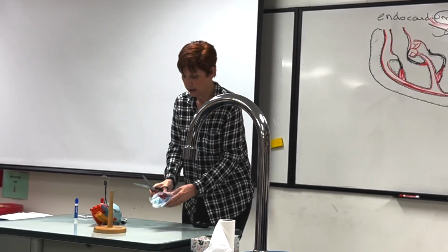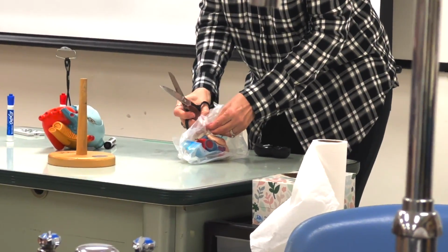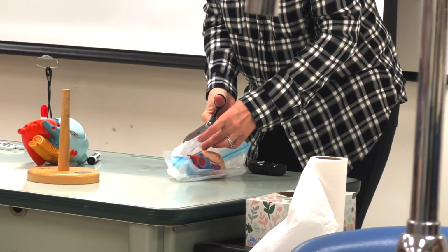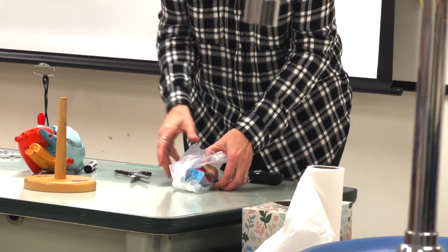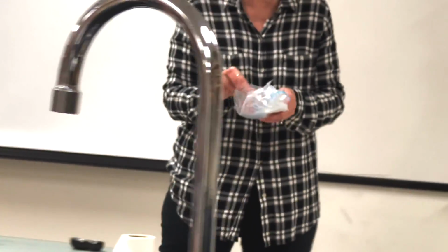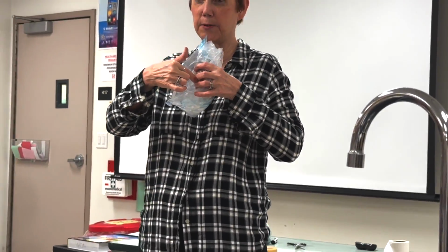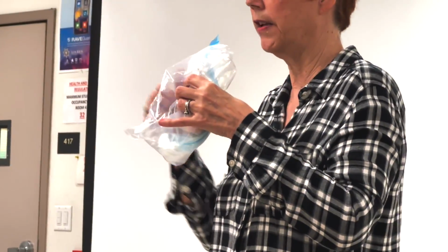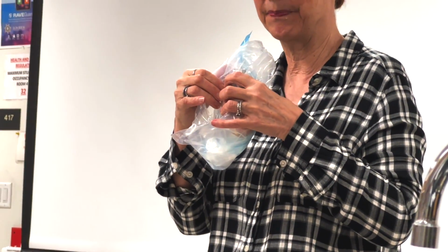So to get access to the heart, we need to cut, and you'll see this on the sheep heart that I bring around. Parietal pericardium, and then while you're dissecting your sheep heart, the smooth, shiny surface is still going to be the visceral pericardium. Okay? The parietal pericardium lifts off, the visceral pericardium stays attached to the myocardium.